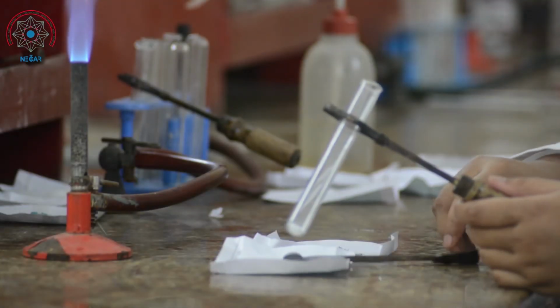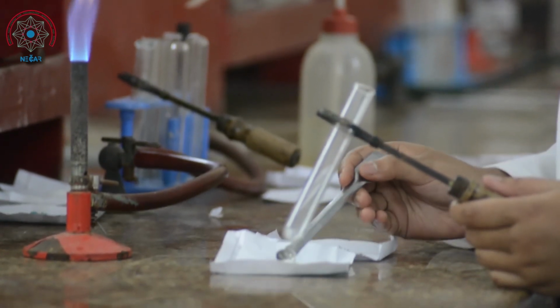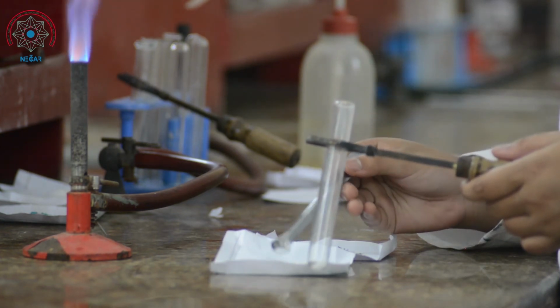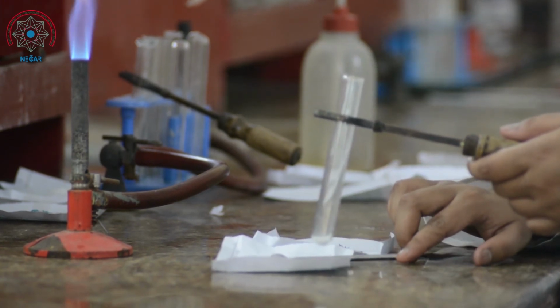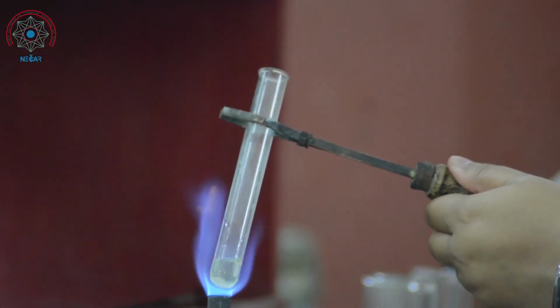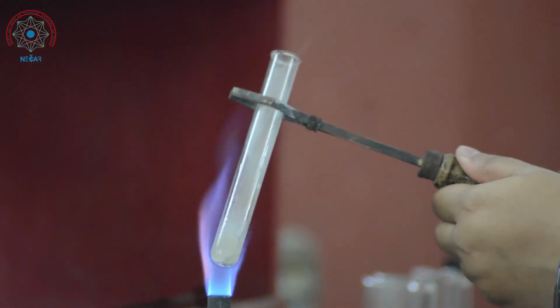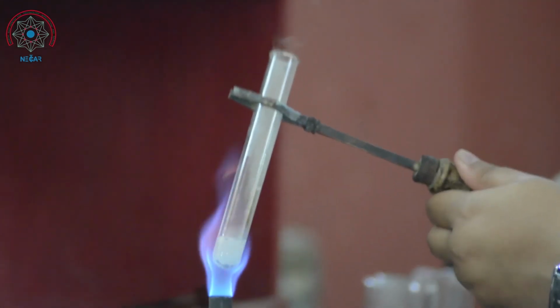Now we are going to perform the same dry test with concentrated sulfuric acid on another salt. Again, we will dry the test tubes, add the salt in the test tubes, then add the concentrated sulfuric acid and observe the changes. While adding the concentrated sulfuric acid, we observe some brown fumes evolving from the test tubes. The intensity of the brown fumes increases if we warm the test solution on the burner.